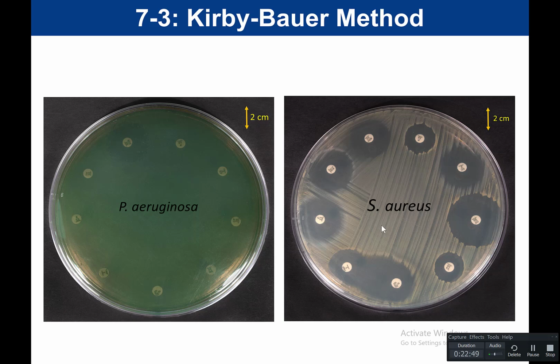And that patient may have a strain that the bacteria is resistant to that antibiotic, like MRSA, for example. MRSA, methicillin resistant Staph aureus. That is a strain of Staph aureus that is resistant to methicillin-like antibiotics. And so it's not going to respond the way that normal Staph aureus would.